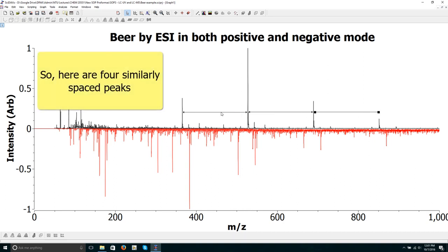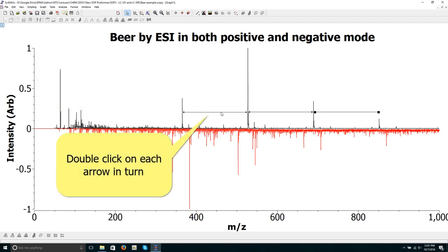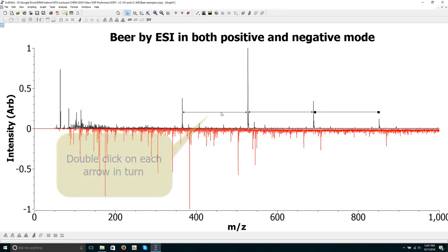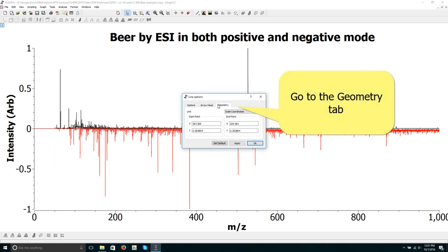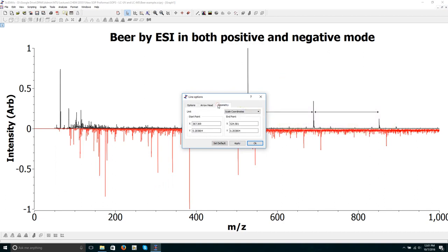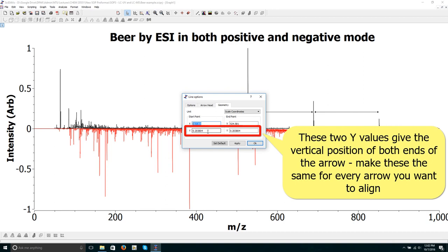Here are four similarly spaced peaks. How can we line the arrows up? Double click on each arrow in turn and go to the geometry tab. These two Y values give the vertical position of both ends of the arrow. Make these the same for every arrow you want to align.